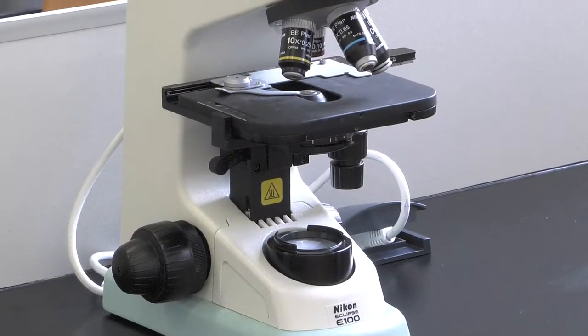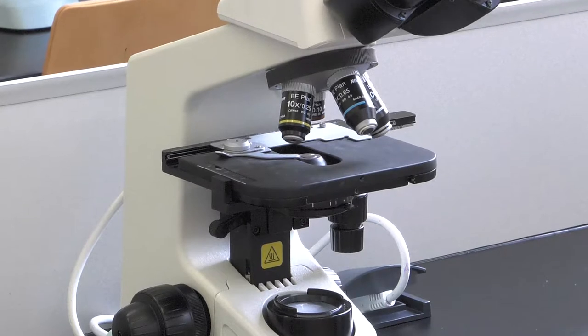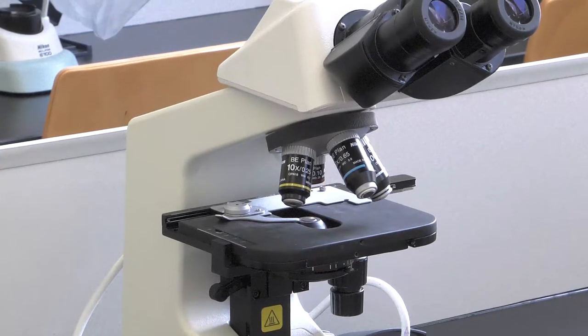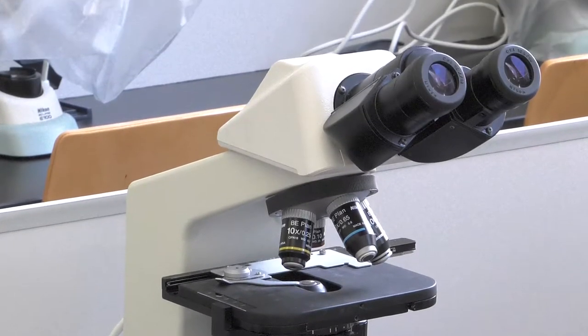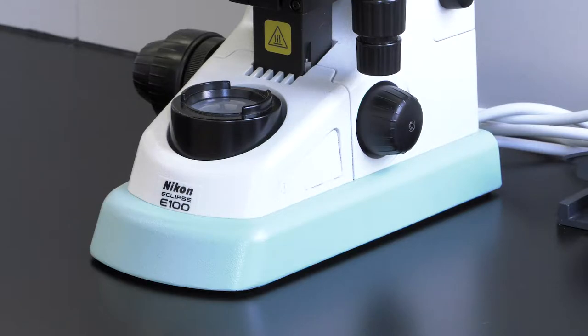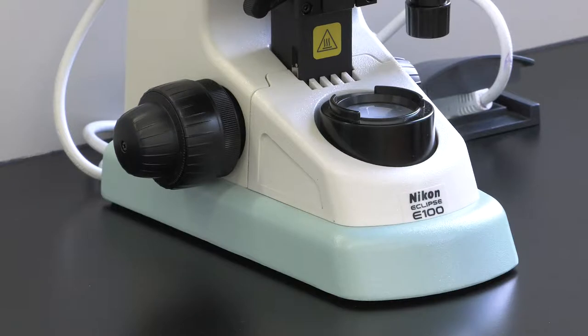Next, we will describe the different parts of the microscope from the bottom to the top. The first element we find is the base. It is a support element wide and heavy enough to prevent the instrument from losing its stability and falling down.